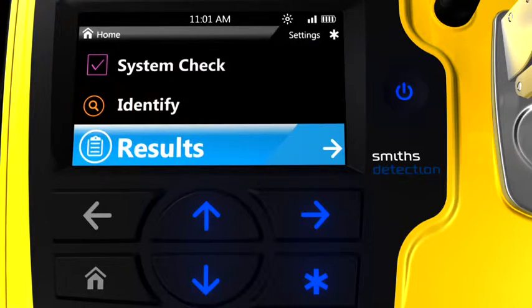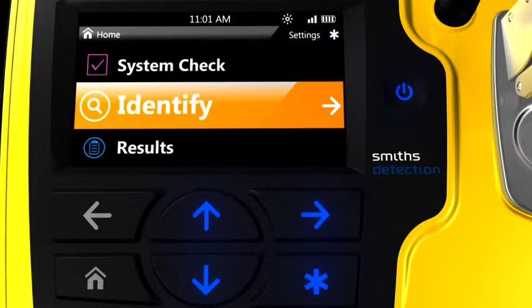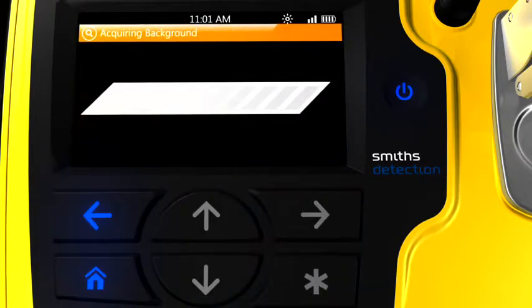By selecting Identify, the user will be guided through the standard operation of the device, where unknown chemical substances will be identified via comparison with onboard databases of FTIR spectra. After selecting Identify, the software shows the user the status of the background acquisition process, during which the signal is being baselined with no sample present on the sensor.